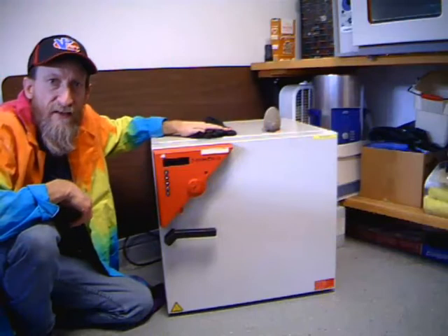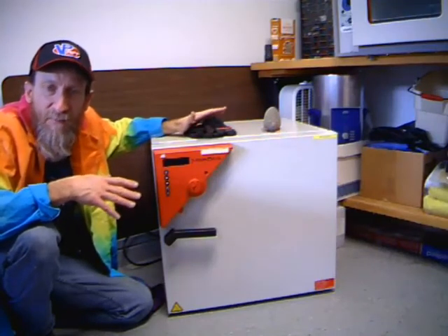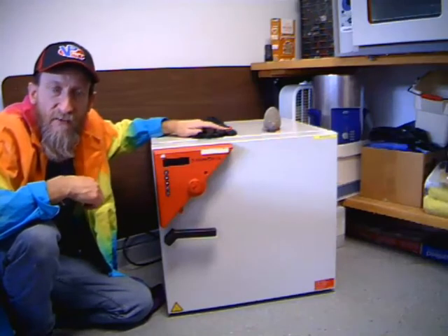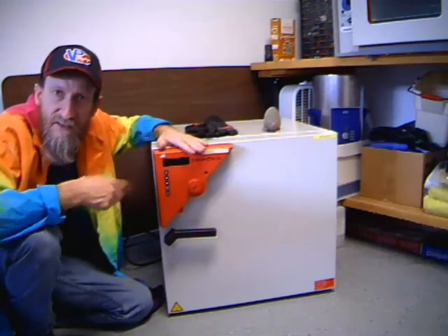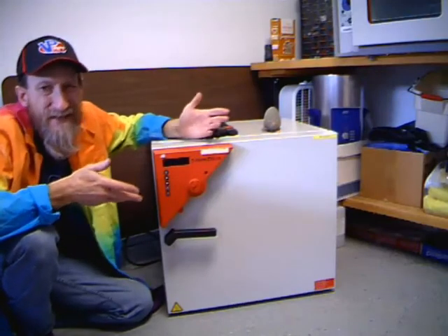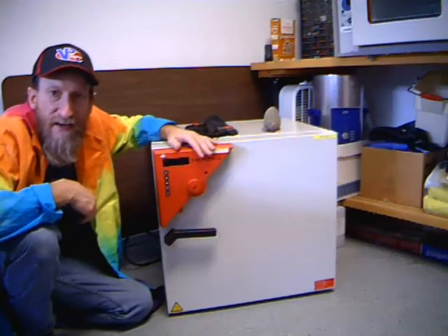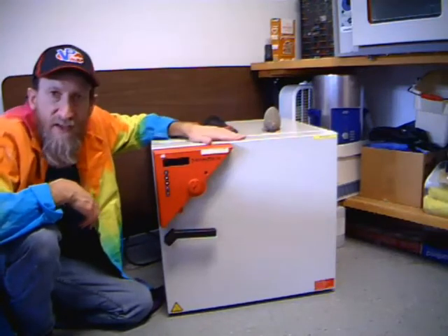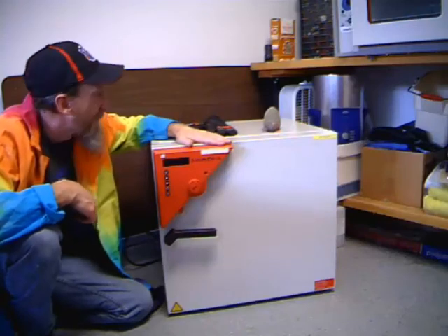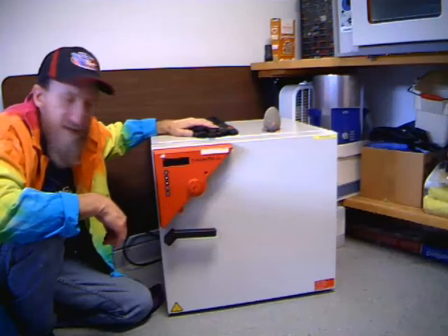This is a laboratory convection oven, very similar to a convection oven you might find in your house, but it's designed to dry out samples that may have a solvent — you precipitate it, filter it out, and want to drive all that solvent off. You put it in the oven and the convection helps dry it out. It's sitting on the floor because, with COVID-19, I'm not allowed to film in my actual lab, and this thing is really big and heavy. It's on a concrete floor, which is a safe, flame-resistant, heat-resistant surface.